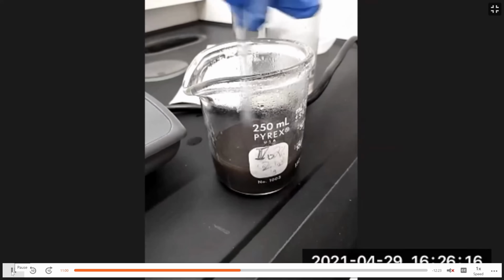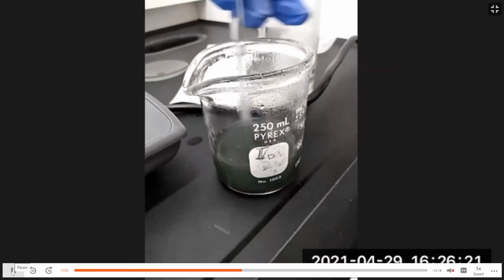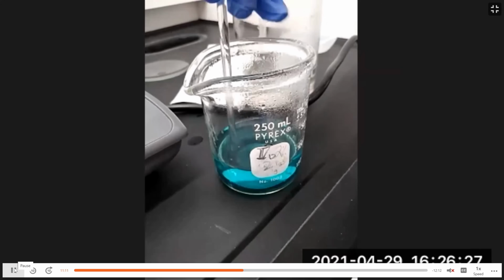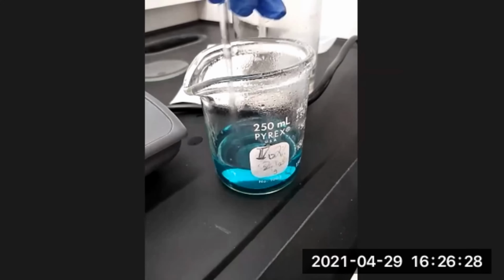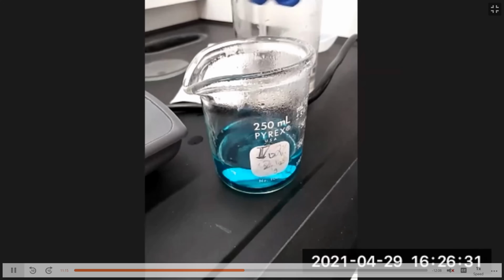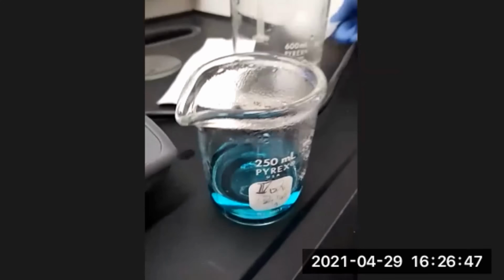Remember, this is 6 molar H2SO4, and it takes a little bit of stirring the precipitate with the sulfuric acid. But you see we go from a black precipitate to a blue solution, indicating the presence of copper 2 ions in solution. So this is the 4th step, or acid base reaction. A nice color change from a black precipitate to a blue solution.